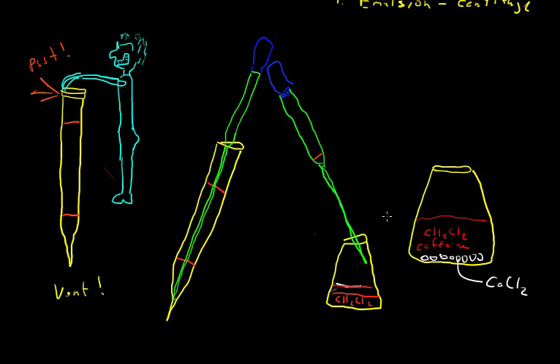After you've done that, the way we're going to dry the dichloromethane is by adding a drying agent. There's several drying agents. What we're going to be using is anhydrous calcium chloride, and there'll be little bottles of that in the laboratory. And those are little round pellets, and so you're going to pour those right into the dichloromethane solution. And you want to continue adding those pellets.